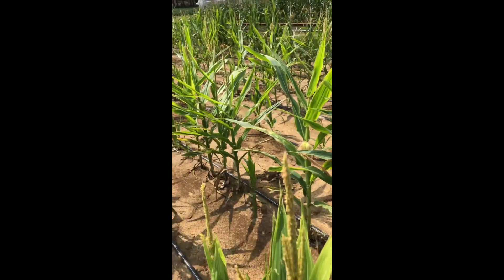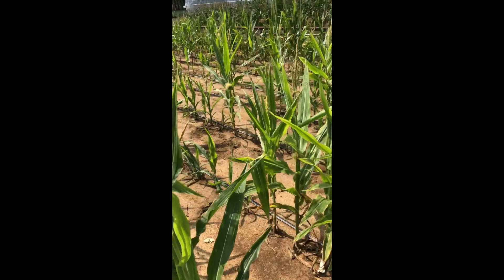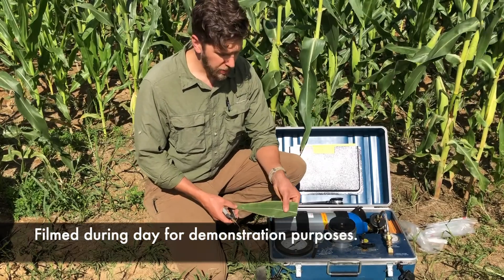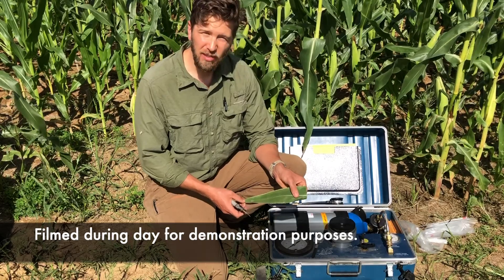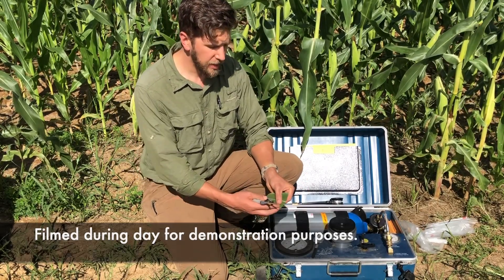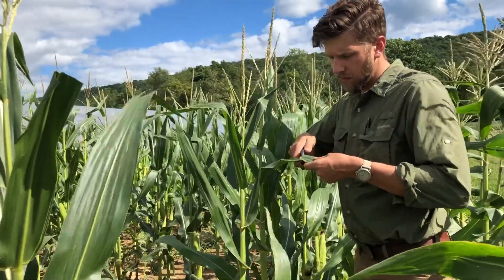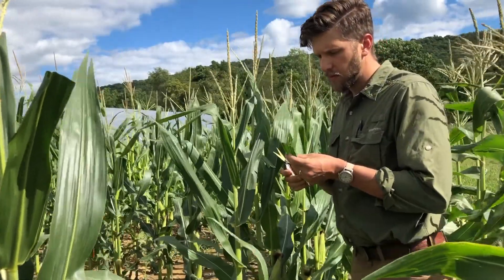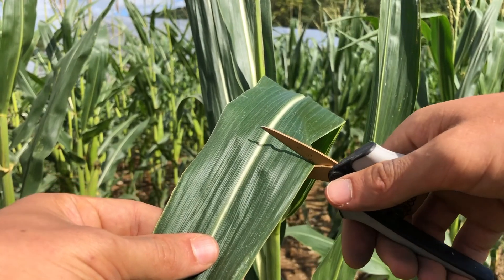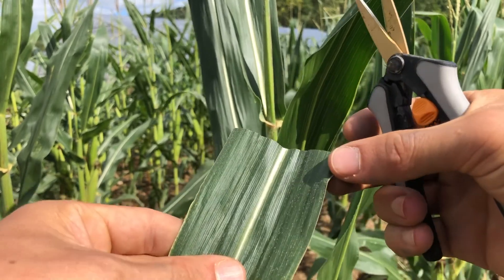Measurements at midday can also be taken to help understand the degree of water stress which plants are experiencing. To take our measurement, we want a very fresh leaf sample just harvested from the upper canopy of our plots, and we want to take this leaf sample with a very sharp set of shears, a razor blade, or a scalpel, so we get a nice clean cut across that leaf surface, which is very important in order to get a good measurement.